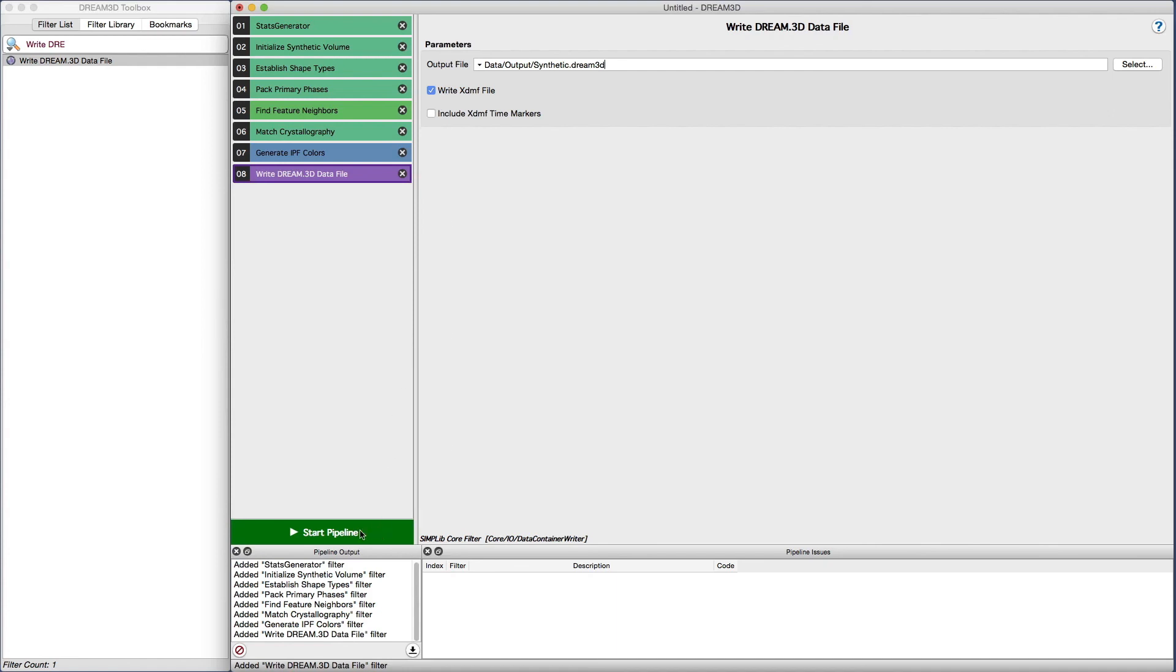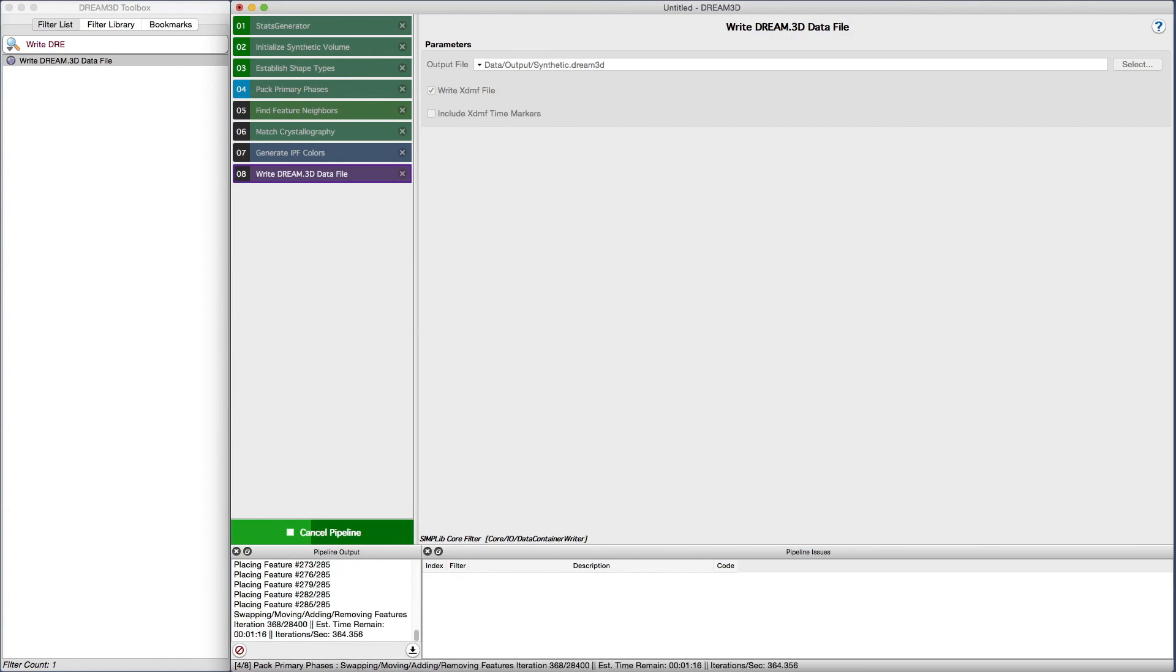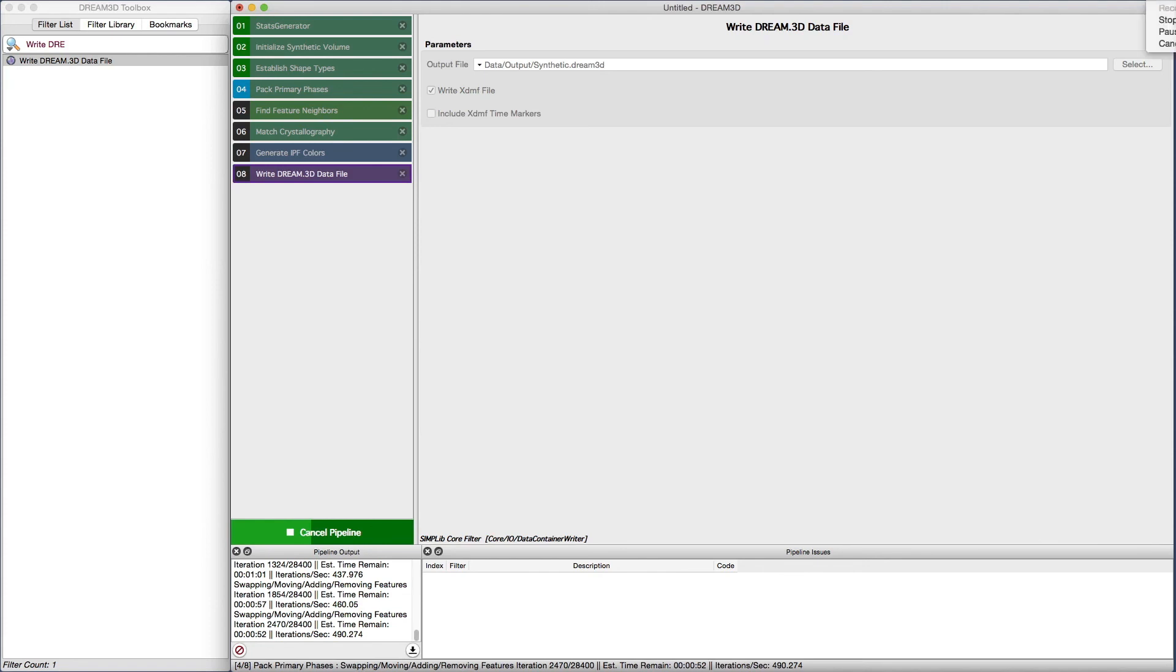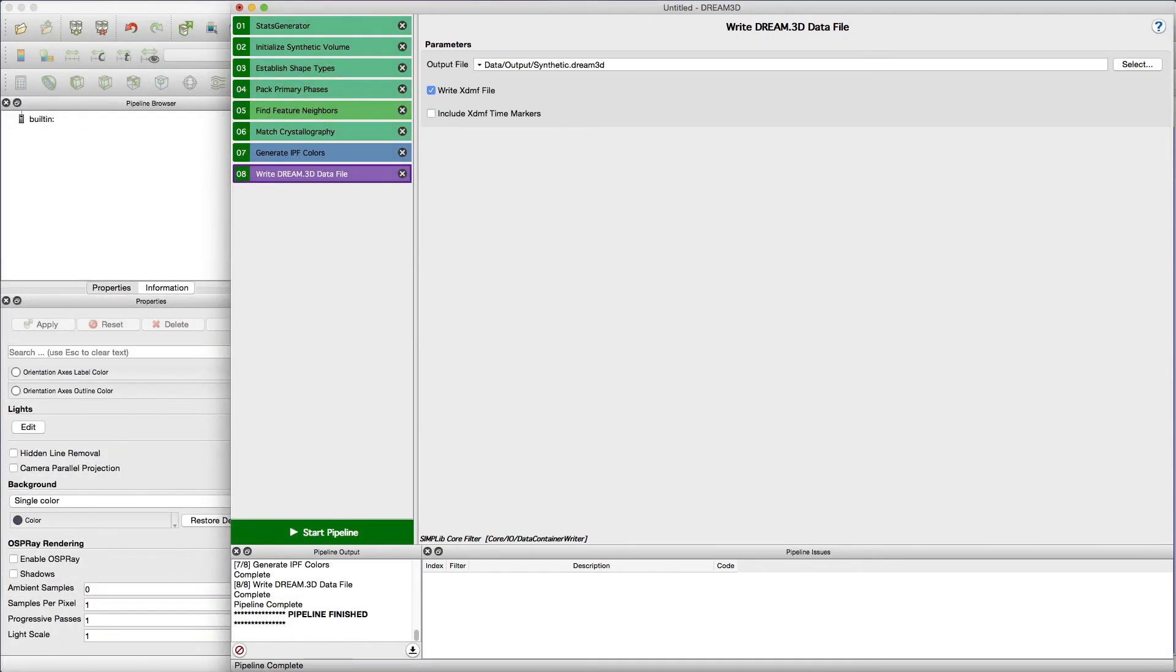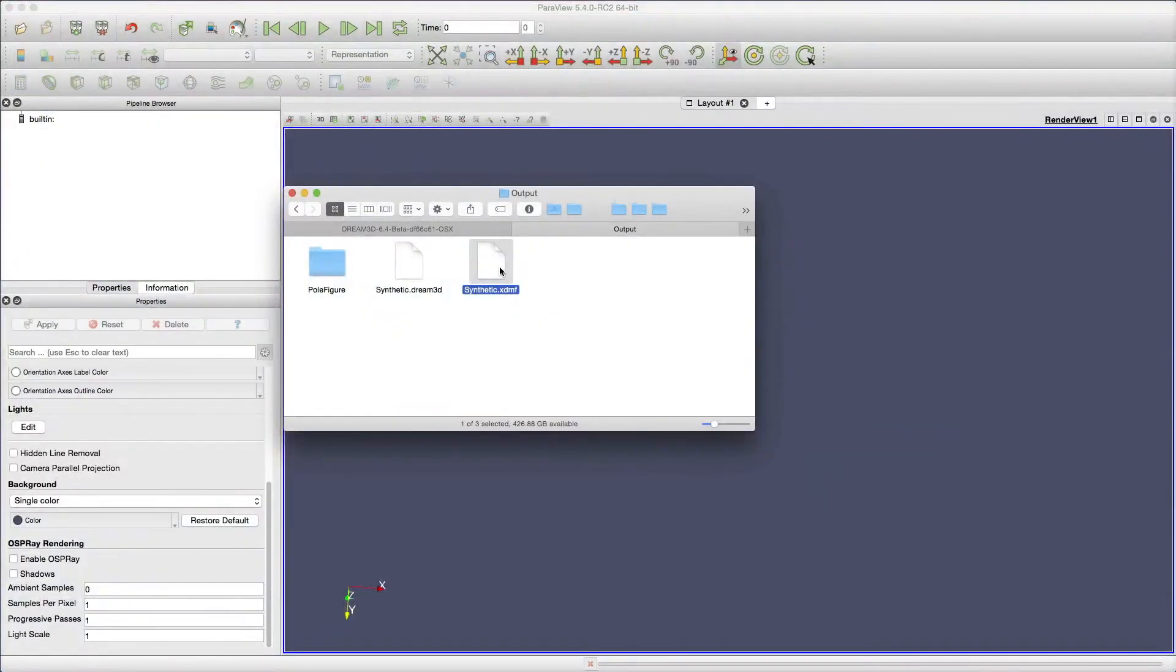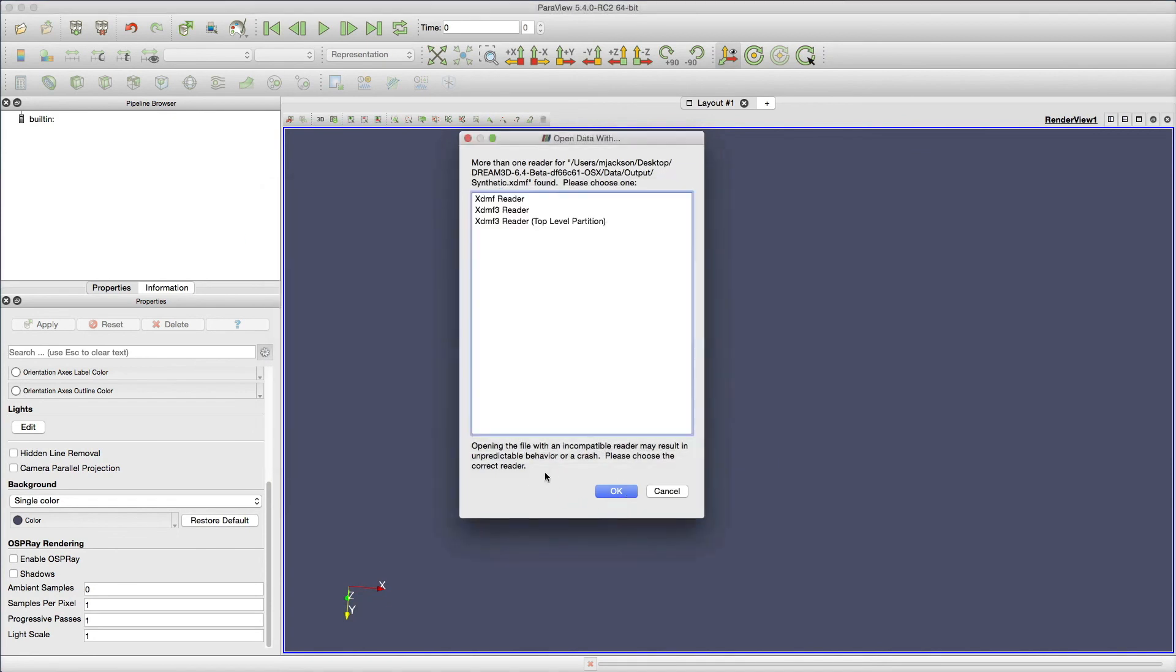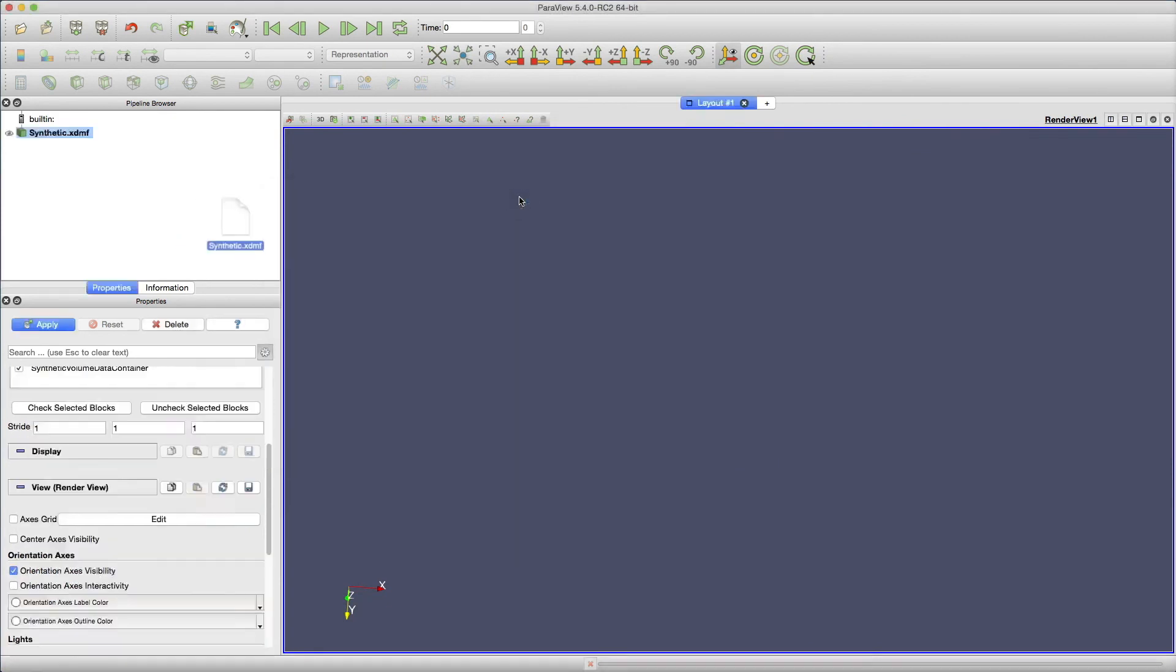When all is ready, we execute the pipeline. And after the pipeline is complete, we can open the resulting XDMF file in ParaView. After the pipeline is done executing, locate the file in the file system and open the XDMF file using ParaView to visualize the microstructure.